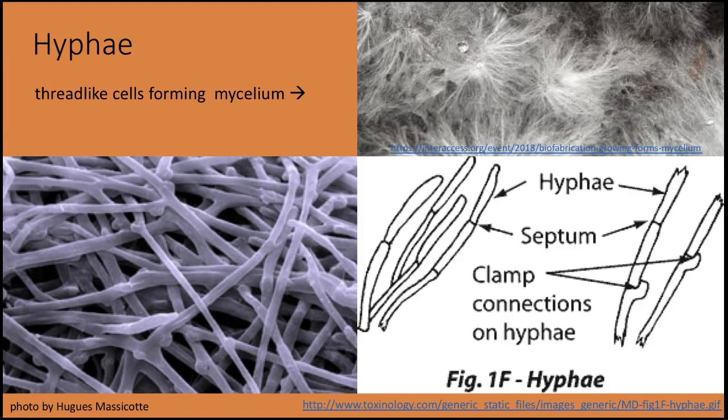And if you were to draw it, they have specific features as well, like the septum. So that's like the dividing wall. So you can base your identification of fungi on how the mycelium or the hyphae actually look under the microscope. Some have a septum, some don't, and some have things called clamp connections. So these little sort of appendages that stick out and grab around the hyphae. And so some have them, some don't, and this is once again a really lovely way to go deeper into identifying your fungi based on these features, whether they have them or not.